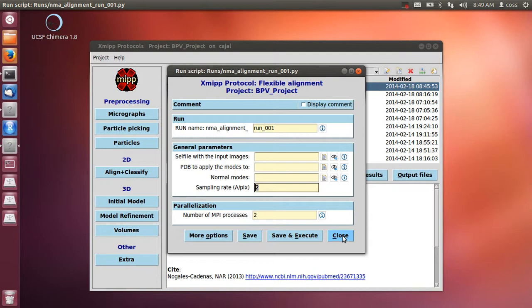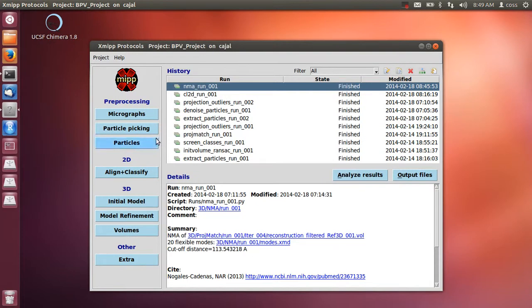So it is not like in the previous example, the normal mode analysis. These are possible movements. What you have here are real movements that have been observed in the images. And for this also we are writing a tutorial of how to do all these NMA analysis, and you may also see the publication that we have with Slavica on it. Okay, so this is flexibility.